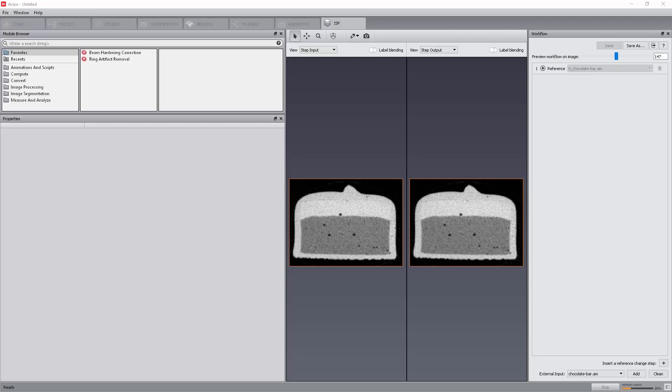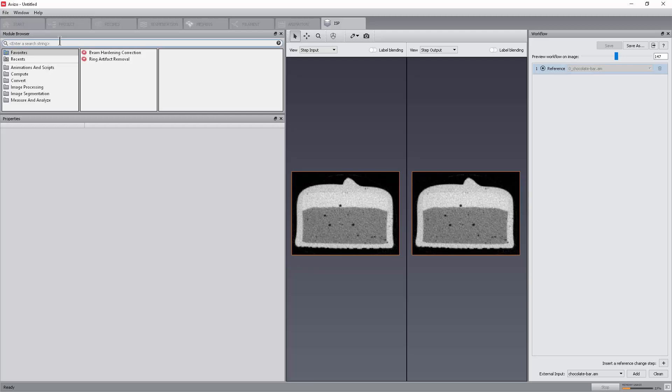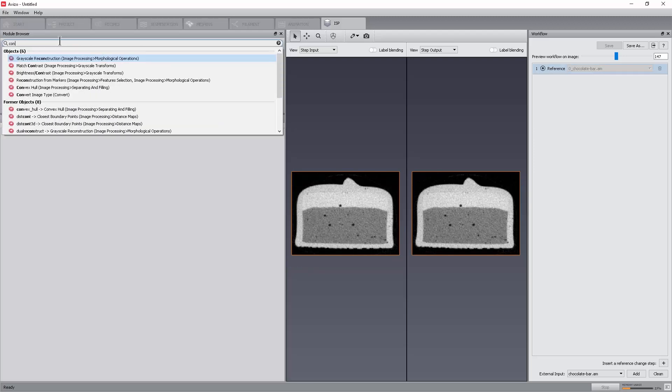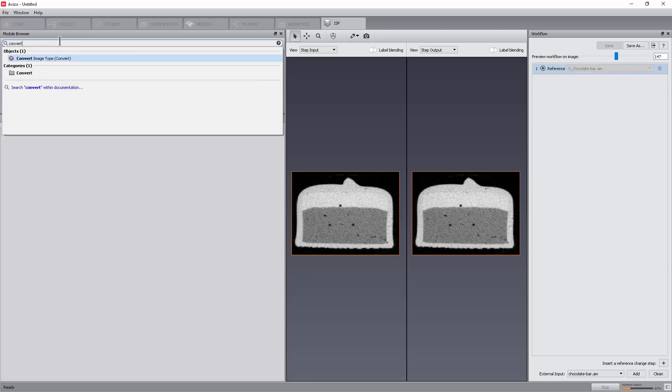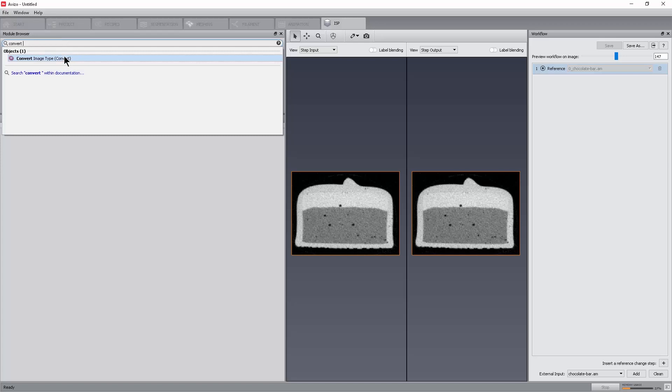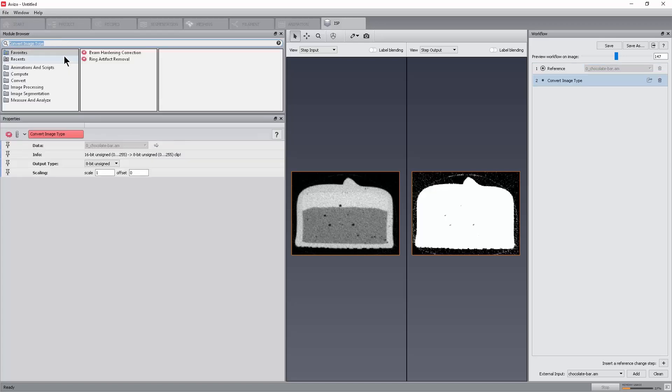Convert the 16-bit data to 8-bit. This first step is necessary for some filters to run. In the Module Browser window, either go to the Convert Directory or select the Convert Image Type Module or type its name in the Quick Search shortcut. Once selected, a step is added in the workflow. It is automatically selected and the module properties are displayed in the Properties Panel.